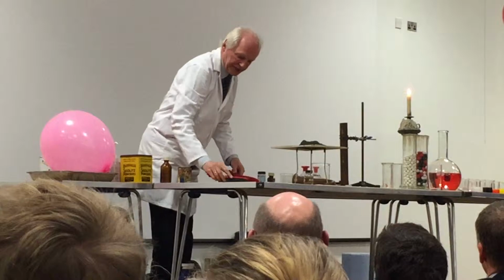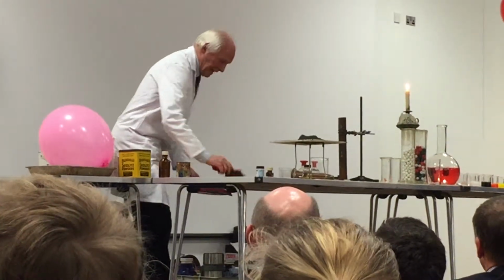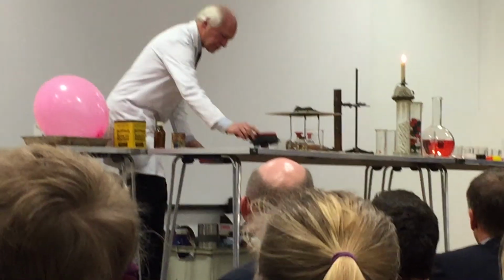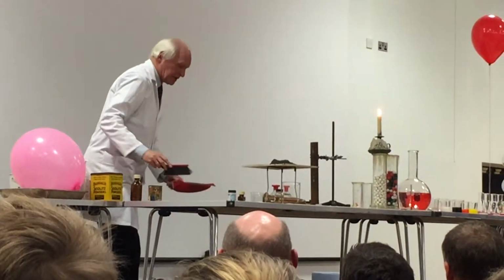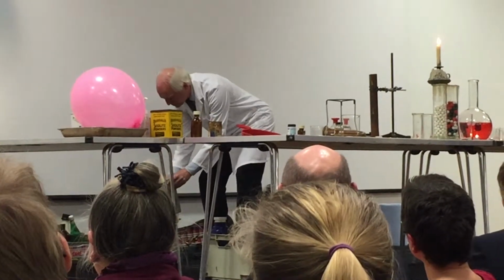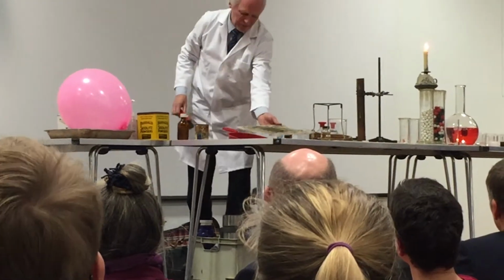And the reason is that if we keep learning to be tidy, then we are well organized and we can hopefully achieve the results that we want to achieve. So please watch carefully there, as I sweep that up, and I've got my pile of ash, and I'm going to put it into a special sand bucket which I have at the back here. So I've popped my ash into the bucket there, and we are now ready.